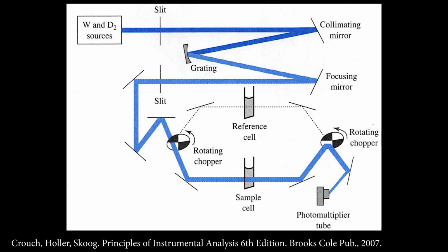Now, just like we had in mass spectrometry, you have to have optics, but they're not ion optics anymore. They're photon optics, or what we're used to thinking of as optics. But just like in mass spectrometry, light loves to scatter. It loves to fly all over the place. When you have a light bulb, it's not just focused in one direction. It's blowing all over the place. So you have to take that light that's blowing everywhere and get it pointing in one direction.